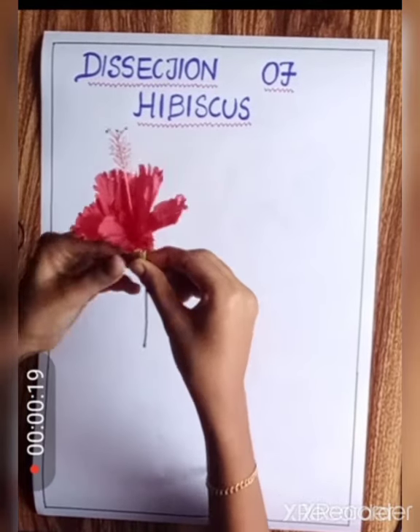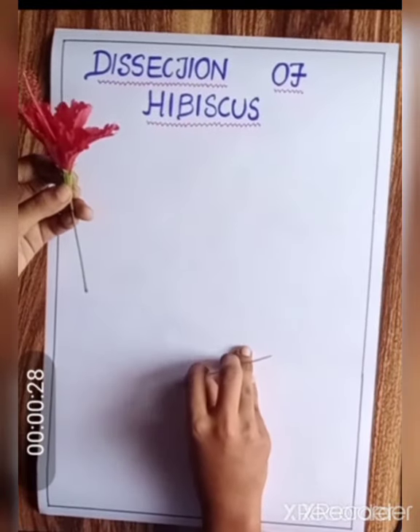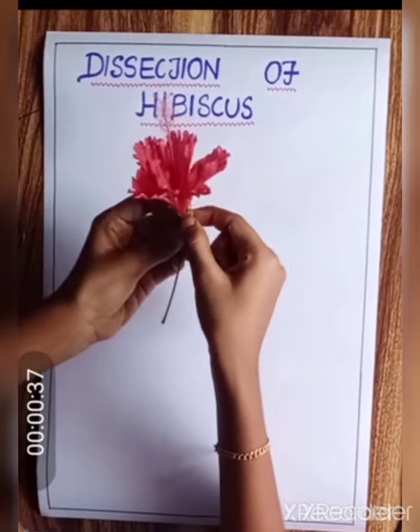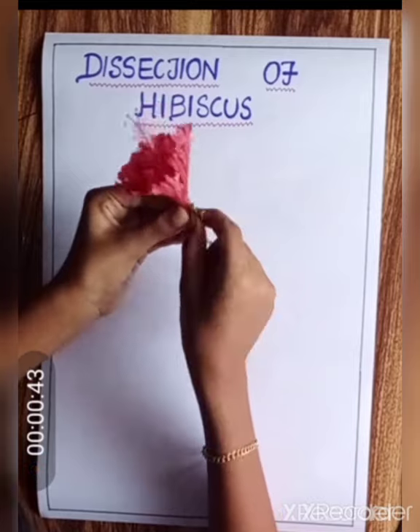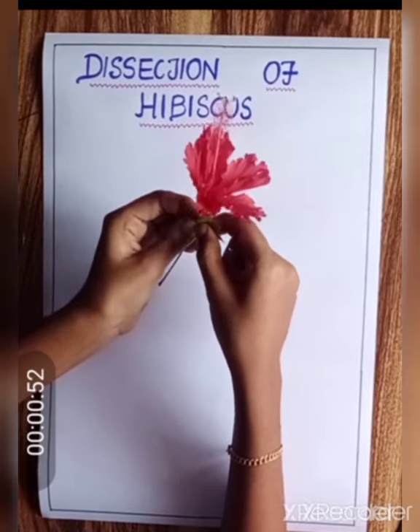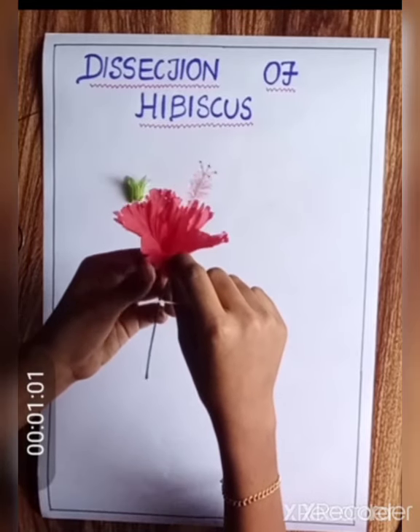First, the sepals are removed. Next, the petals are removed.